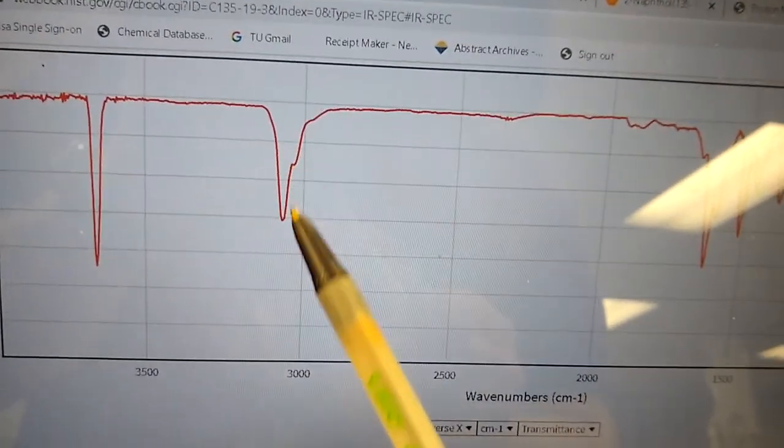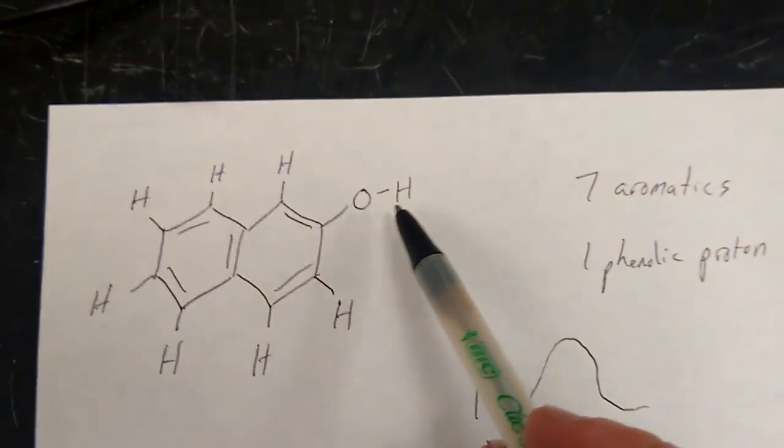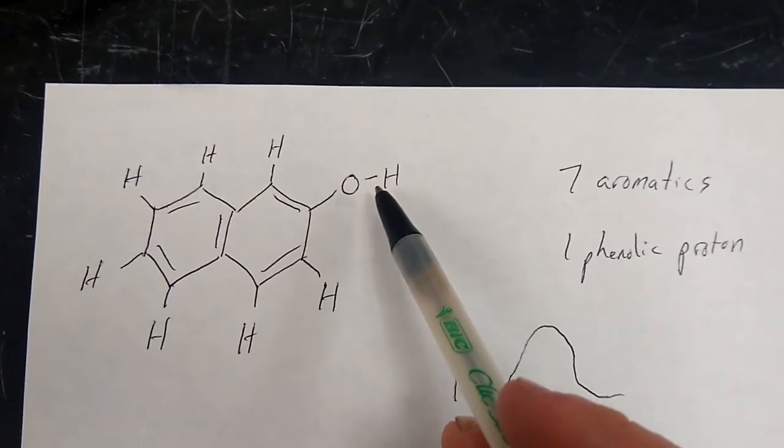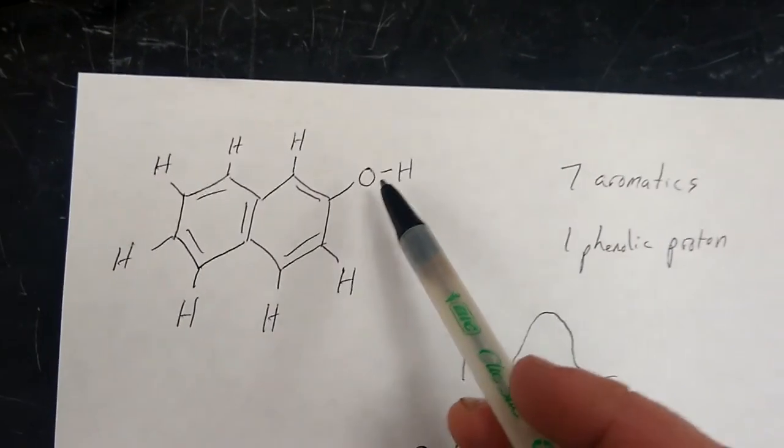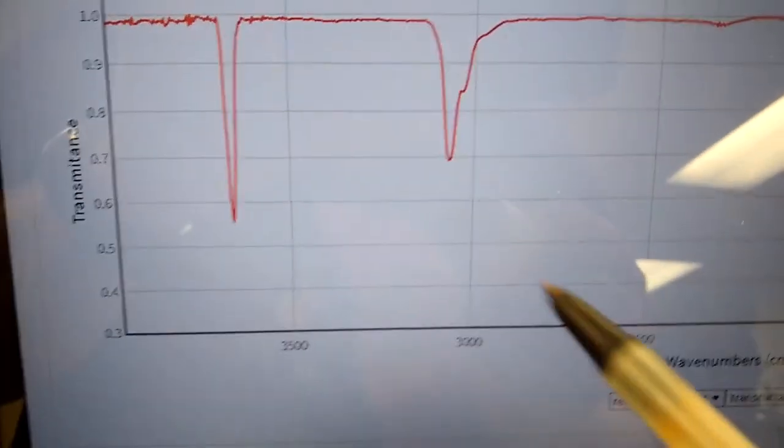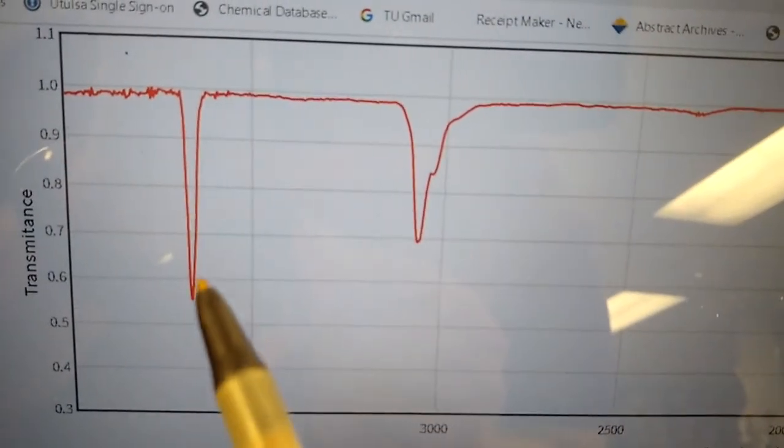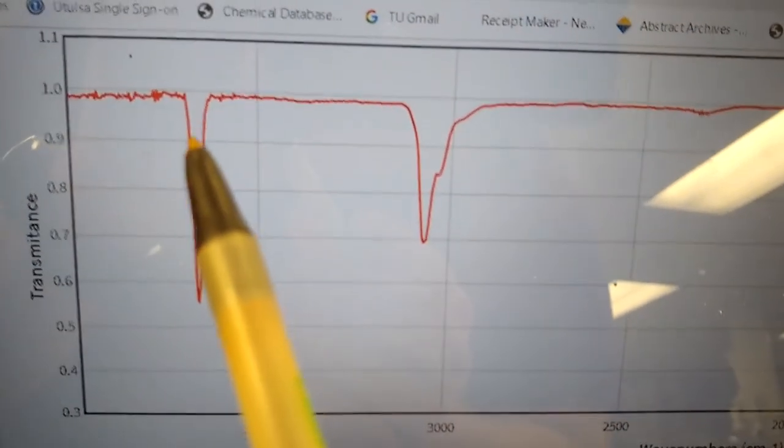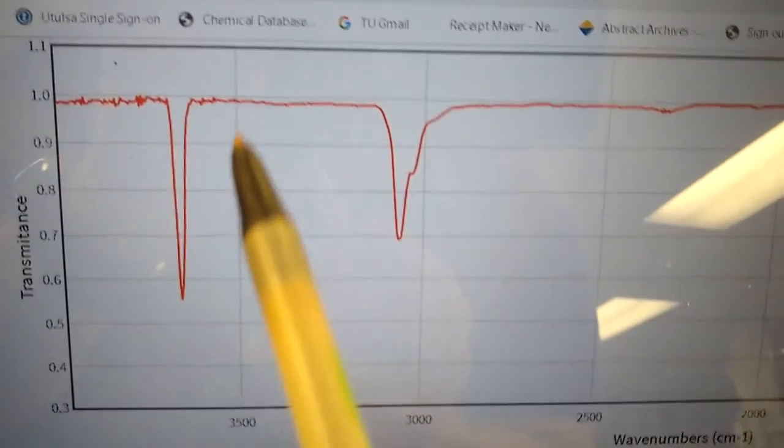If you look at a spectrum of two-naphthol, you'll see right there you've got a signal. And your OH from the phenolic portion, that's usually above 3200 or so. And if you look at the spectrum here at 3700, you see a big sharp signal for the OH stretch. Usually when you see it, it'll be a lot broader than that. That can be concentration related a lot of times.